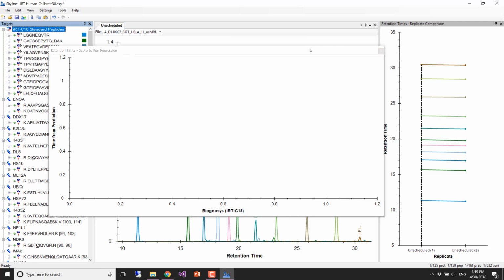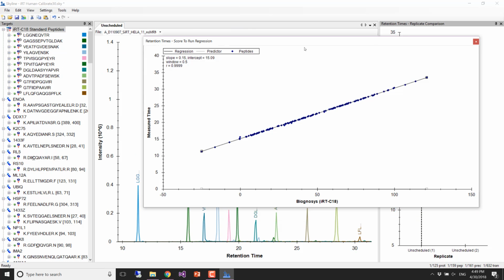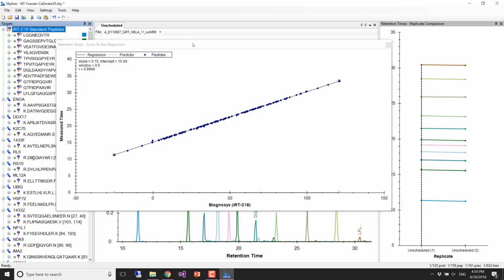And then I'm going to switch the regression plot back to correlation. Yeah, what is that? It's having problems with auto-calculating its predictor. I don't quite know what's up with that. I guess undo. Did that fix it? No, I don't know. All right.